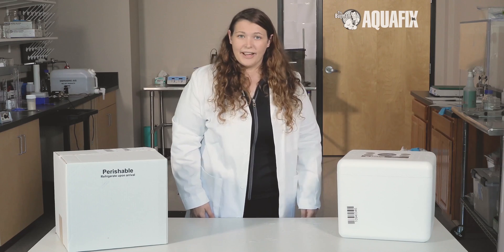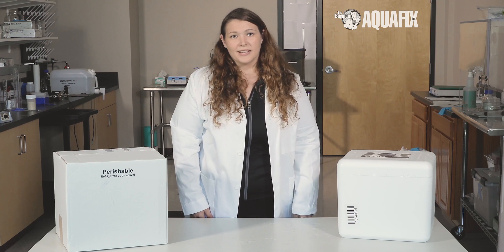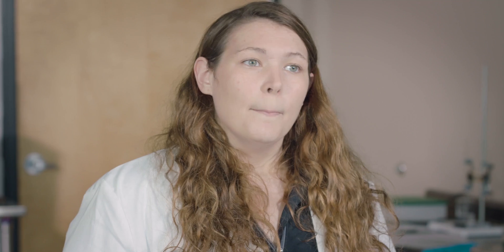Send your samples to the provided address. It is important to use UPS or FedEx to send your sample next day, Monday or Tuesday, to allow the lab time to work with your sample before the weekend.